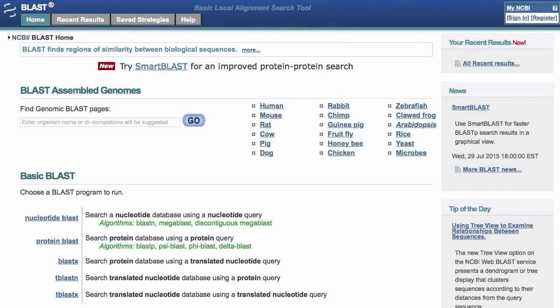This genomic assembly was preliminary, but at least there was some assembly. It's a little different in some cases — for example, if I want to search another member of the Hydra genus there might be less data. Say I want to look at Hydra oligactis. In this case, the SRA data might be the best option.